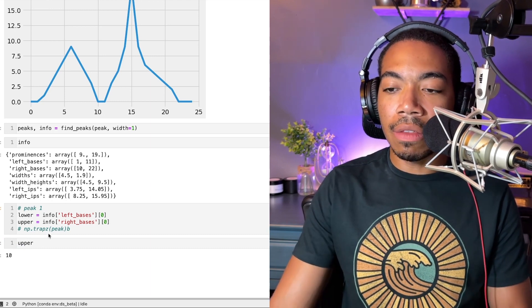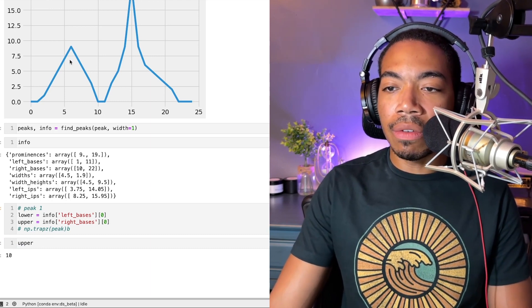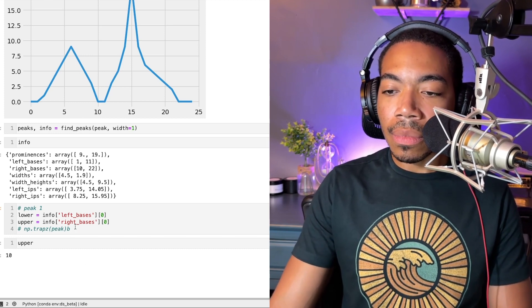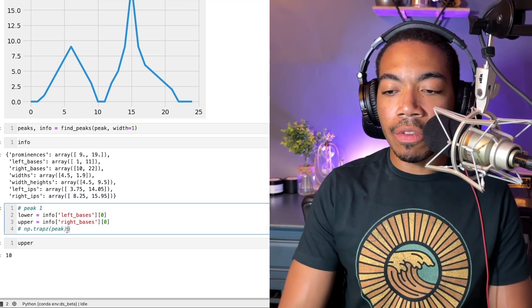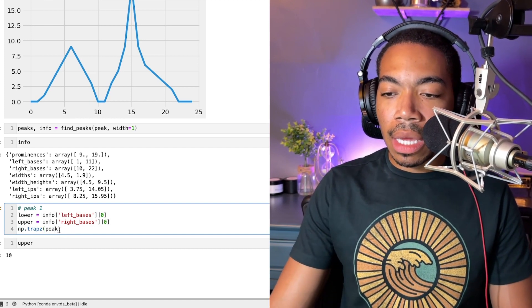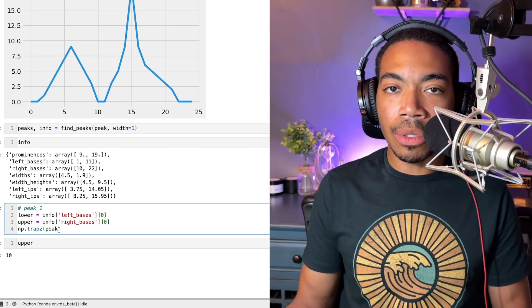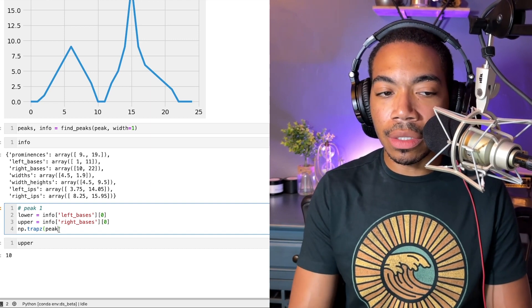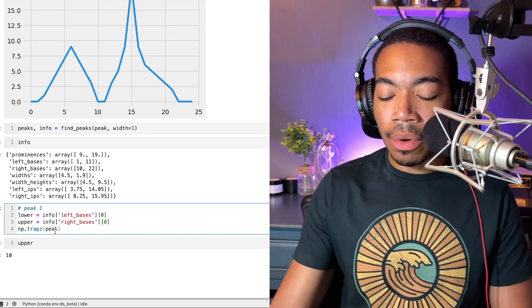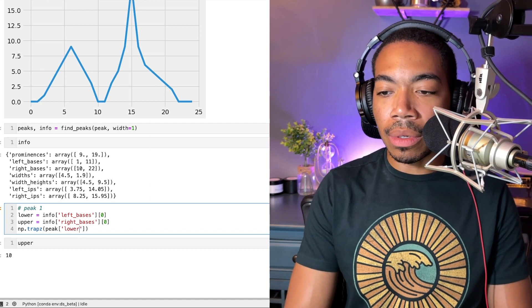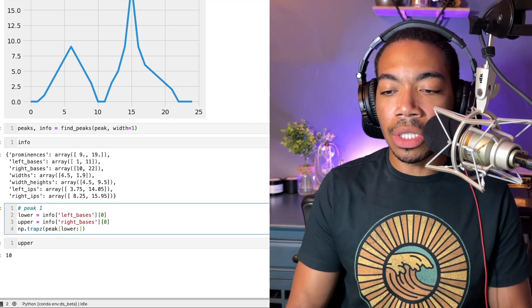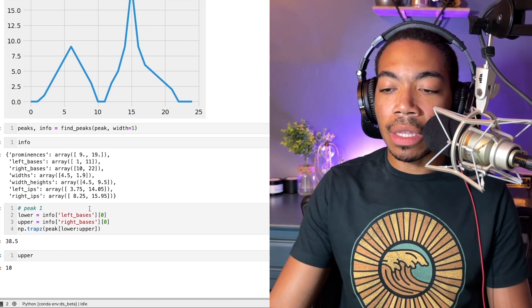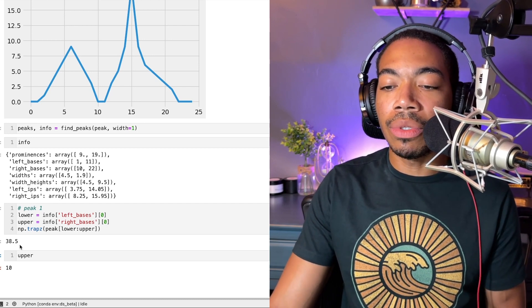Now we can pass this information into trapz and perform our trapezoidal integration using that information. Simply, if we now create a bound around lower to upper—this is just slicing a string—if we provide this bound, you see we have integration equal to 38.5, and this is for peak one.